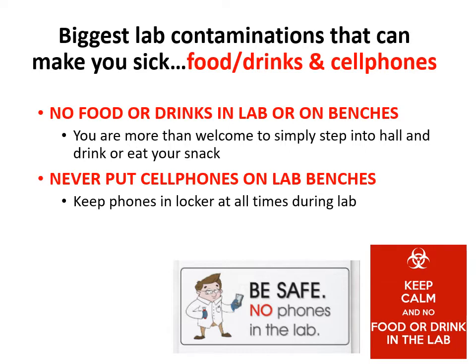In my class, in terms of the labs, you are always more than welcome to step out into the hallway to have your snack or to have a drink of water, but you cannot have any of that in the laboratory itself. Also, make sure to never have your cell phones anywhere in the lab. Okay, they have to be kept away. Again, I know that's brutal to ask people nowadays, that we are addicted to our cell phones, but trust me, you do not want to have any bacteria that we are working with end up on that cell phone, where your hands are touching it all day, where you're putting it near your face, and where you're bringing it home to where your loved ones are.